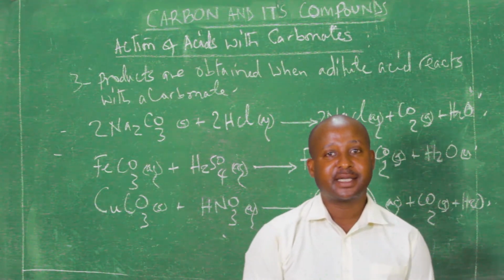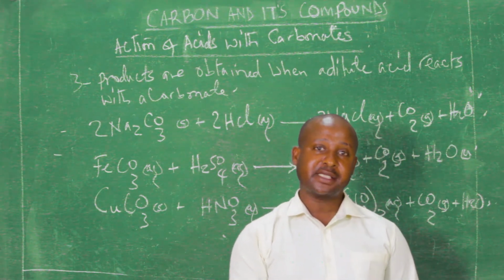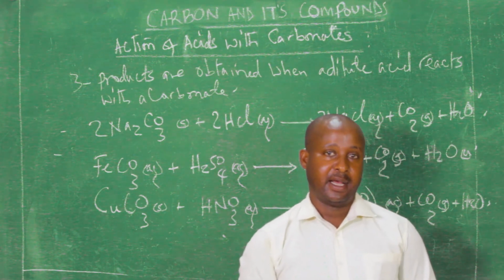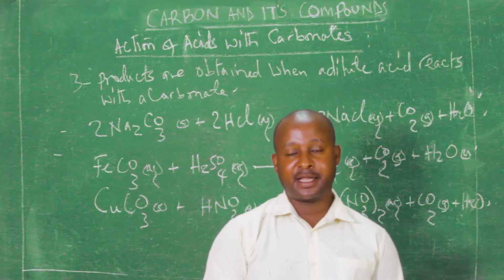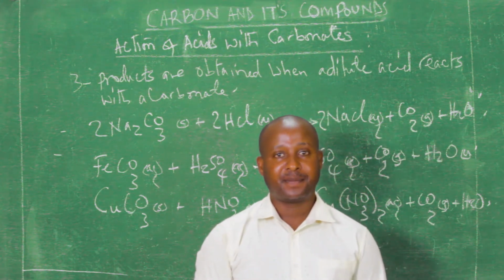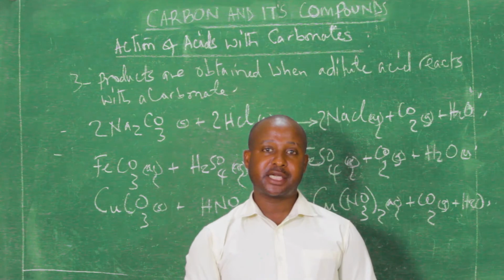Let's look at the test for the carbonate radical. How do we test for a carbonate radical in a laboratory? And how do we confirm that such and such a material or substance is a carbonate radical?